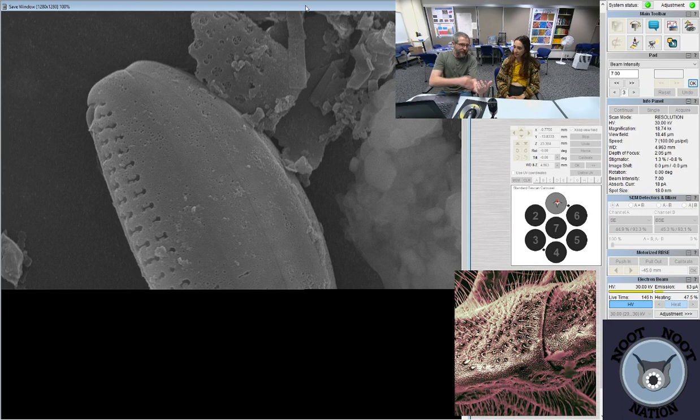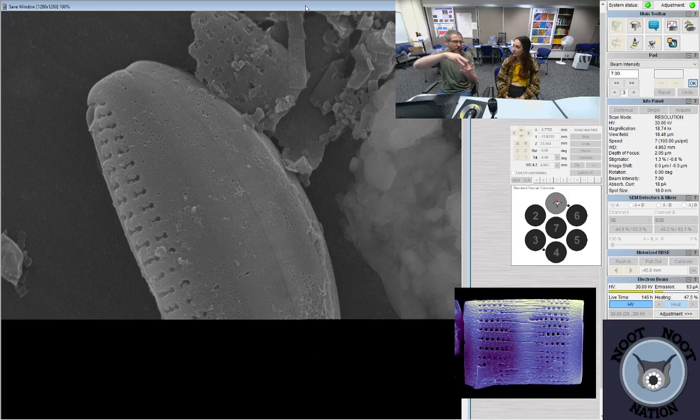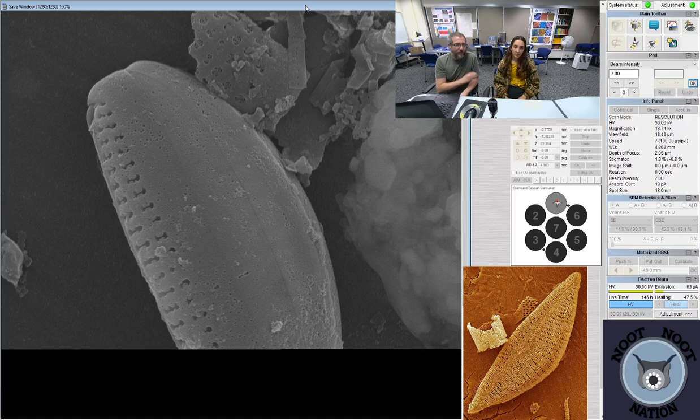If you try to take a picture of those, they'll also charge because it's hard for the electrons to basically get off of the diatom quickly. So anytime there's a spine or something that's really high up off of the stub, it will cause the electrons to charge up on that surface, and it's hard for them to discharge, basically.